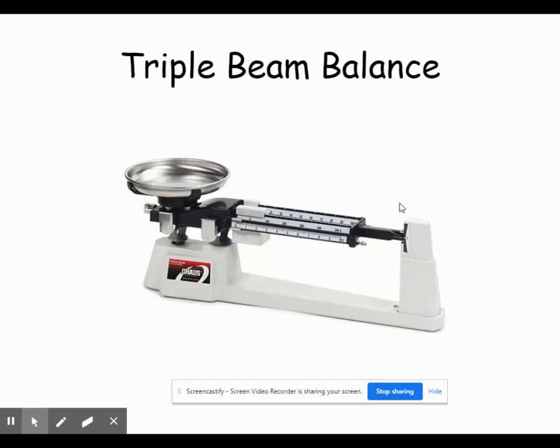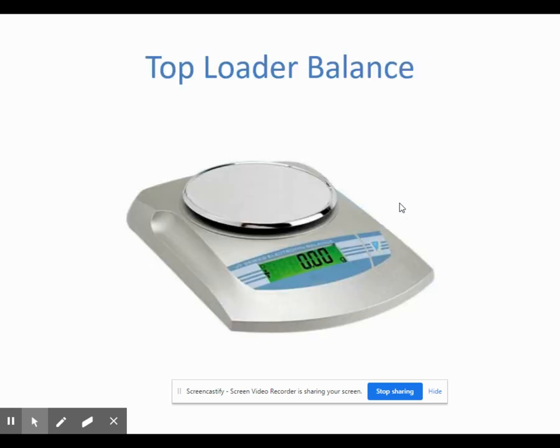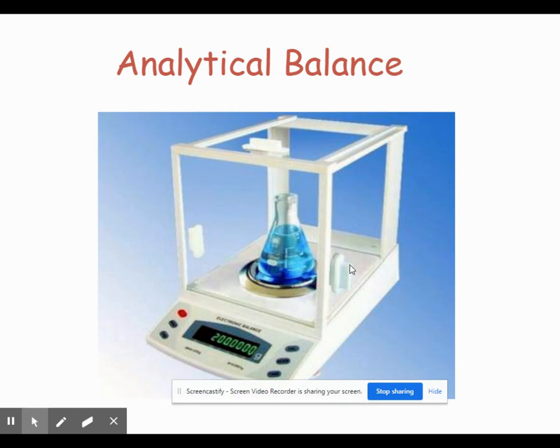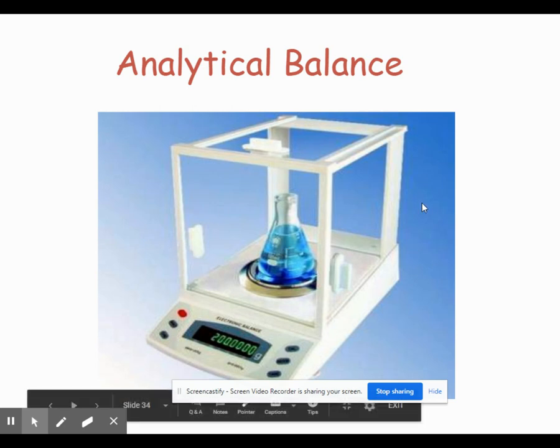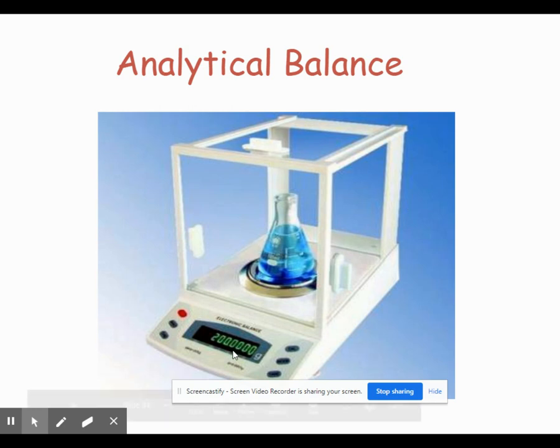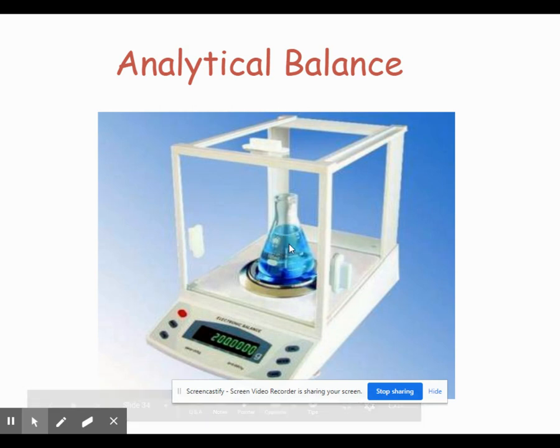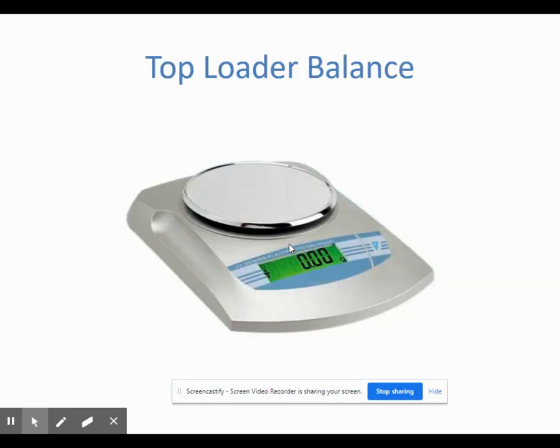There are three types of balances. The first is the outdated triple beam balance, which we won't use. Then we have a top loader balance with only a few decimal places. Finally, we have the analytical balance — the most accurate of the three. Analytical balances have little glass doors on the side to prevent air currents from affecting the measurement. Notice how many zeros appear after the decimal — for example, a reading of 200.0000 grams. Analytical balances are very accurate but also very delicate, so always use a weigh boat or weigh paper with them. For measurements that don't need to be super accurate, the top loader balance is fine.